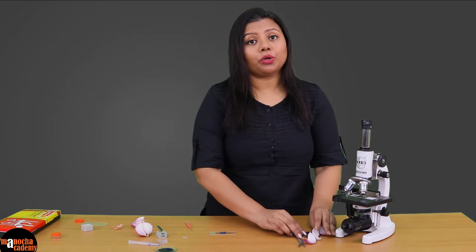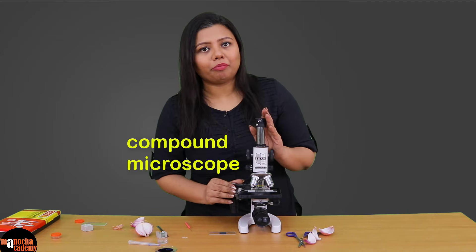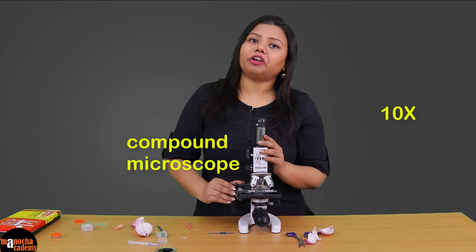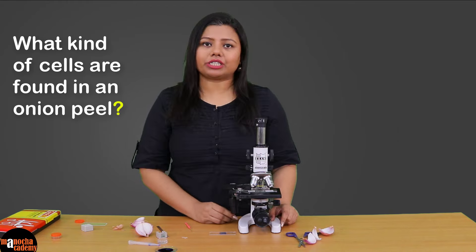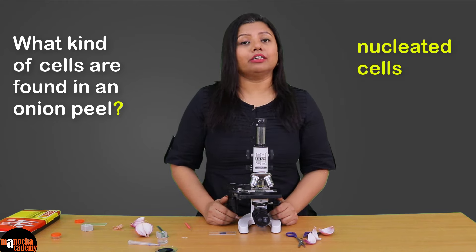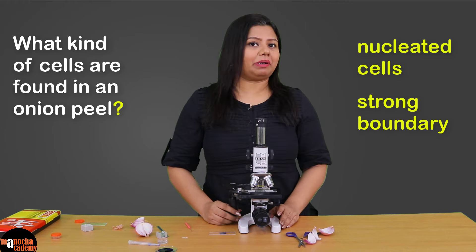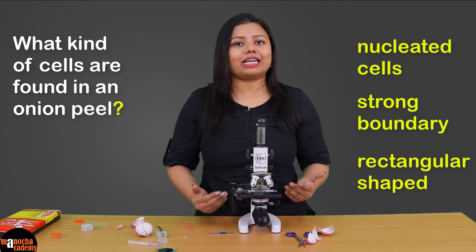We will put the slide under the microscope and observe it. I am using a compound microscope. First I will use a 10x magnification, which is low power, and then a 45x magnification, which is high power, to observe the cells. What kind of cells do you expect to see in the onion peel? Since these are epidermal cells and plant cells, we expect to see nucleated cells with a very distinct boundary, and the epidermal cells are usually rectangular in shape.